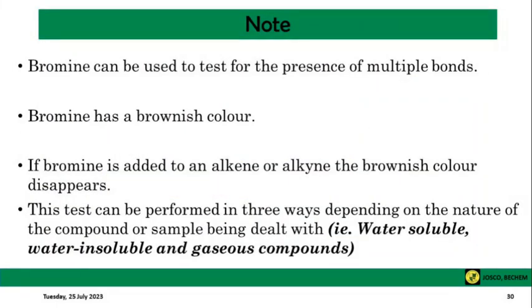There are a few things that we are to note. For this kind of test, we can have the nature of the compound that we are going to test in three forms. One, the sample being water soluble. Two, the sample being water insoluble. And three, when the sample is in gaseous form.